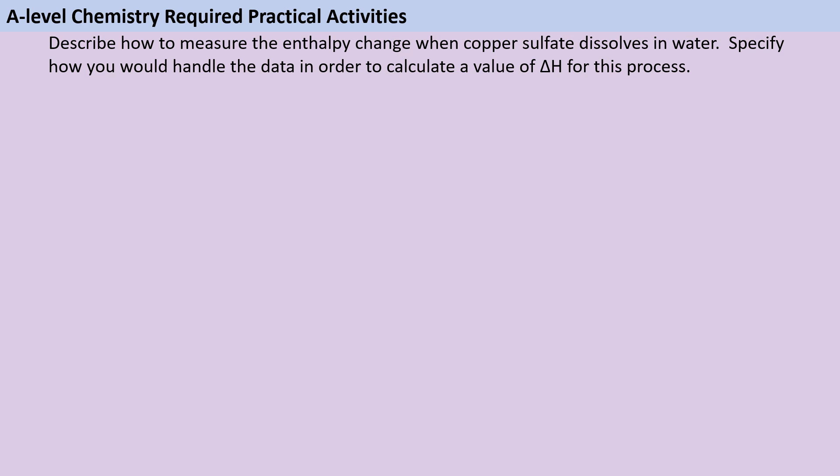The first thing we need to do is accurately establish the volume of water we have and the mass of copper sulfate. The precise volume and mass are not important, as long as they're reasonable. You're not going to have a kilogram of copper sulfate in one cubic centimeter of water. But we do need to specify which equipment we're using to measure this. So to begin with, I'm going to measure out 50 cm³ of water using either a burette or a volumetric pipette. I'm not going to use a measuring cylinder because the uncertainty on that would be too high.